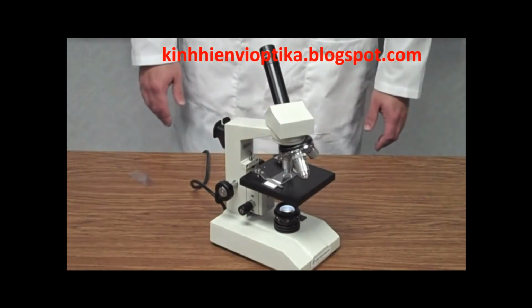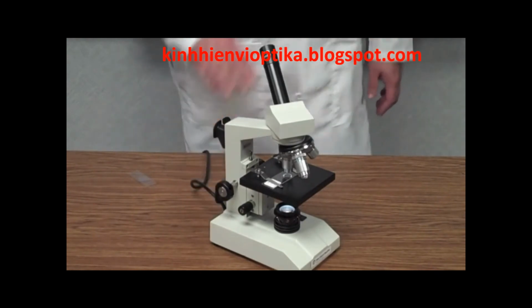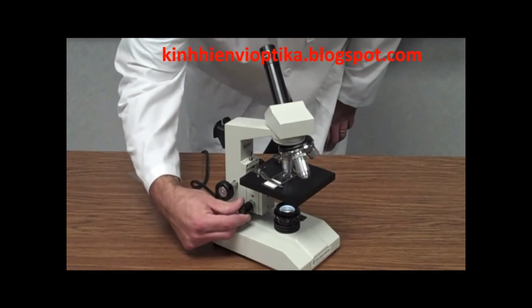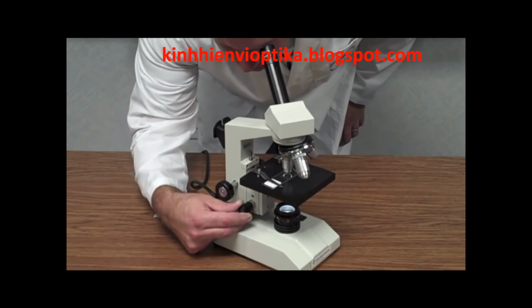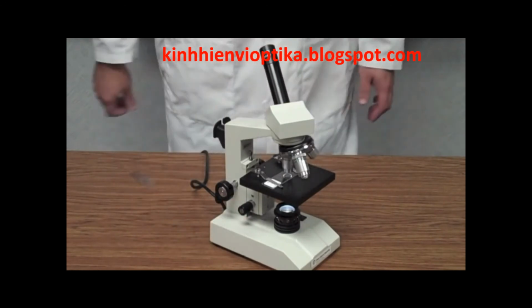Now, if I've done my job correctly, I should not need to touch the coarse adjustment knob again. I should be done with the coarse adjustment knob. I should be able to simply use my fine adjustment knob to do a little bit of focusing, and I see my image much larger, much clearer through the eyepiece.